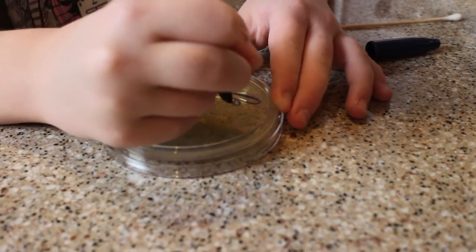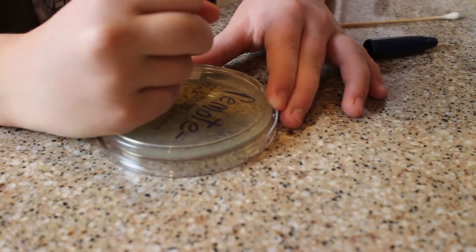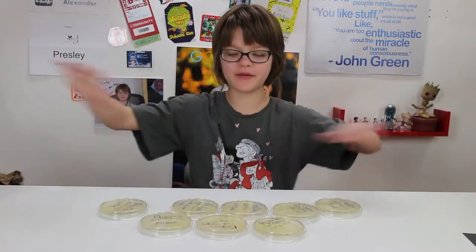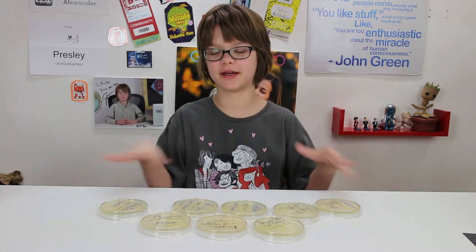It's really, really important that you label all your dishes with what's in them — like 'case not cleaned,' 'fingers not cleaned,' and stuff like that — so you know what's in them. Because if you don't know and you lose track, your experiment's just going to fall apart because you won't know which one's from the clean, which one's from the dirty, and which one's from what object. So now we have all of these samples, labeled so I know what they are, like 'fridge white paper towel,' 'remote wipes,' and stuff like that.